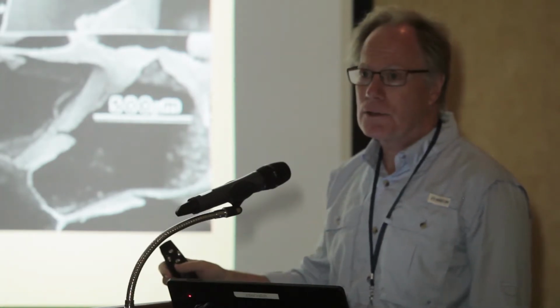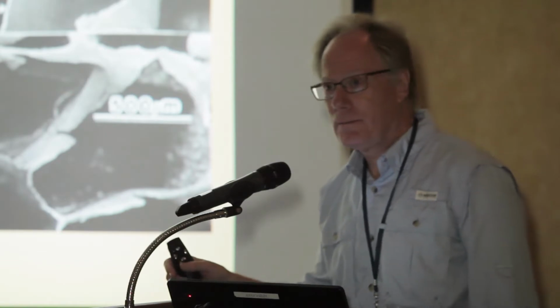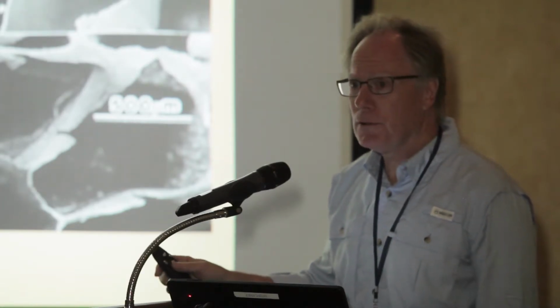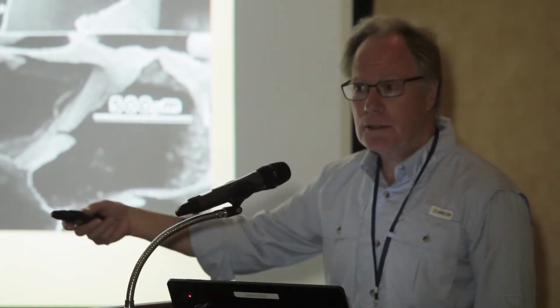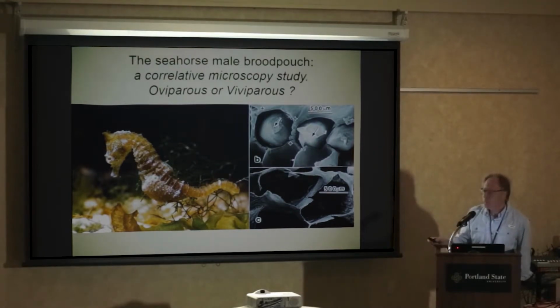I've been working on seahorses now for quite some time. I can't harm them anymore, so I try to come up with non-invasive methods of working with them. The best I've been able to do is get into museum specimens that are way past caring, and then look at microscopic techniques that I can use to answer questions without cutting their heads off anymore. So that's what this is all about, and this gets into correlative microscopy.